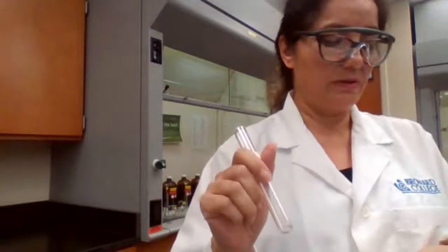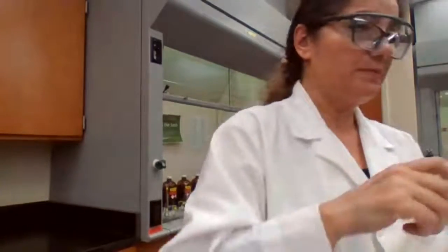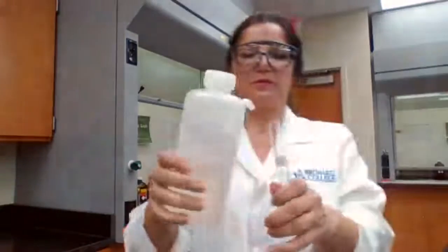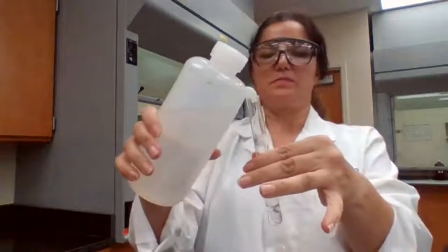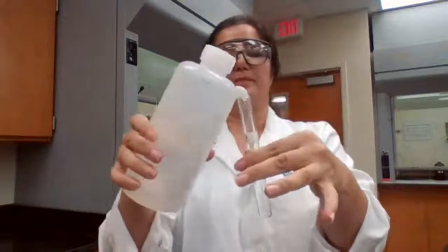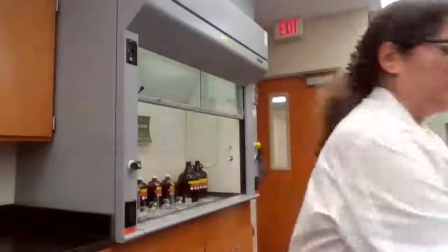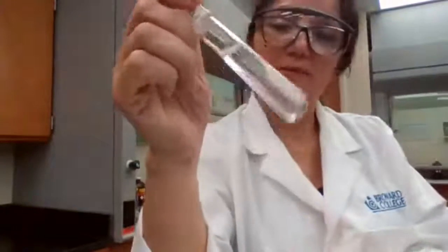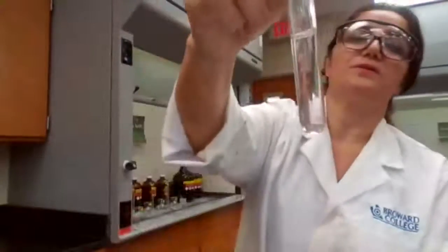In a test tube, we are going to add deionized water and make it half full. Record your observation. Just the clear water, the first test tube is not so clear.